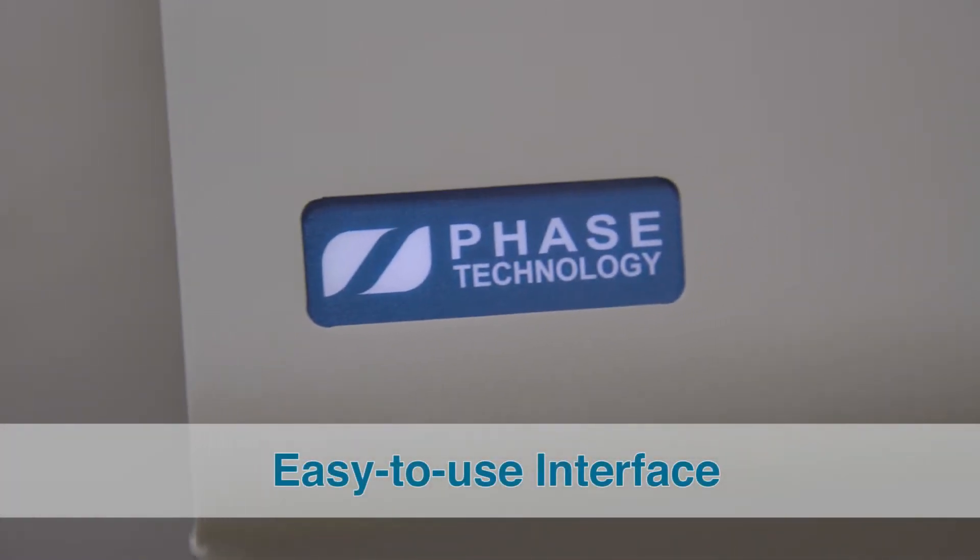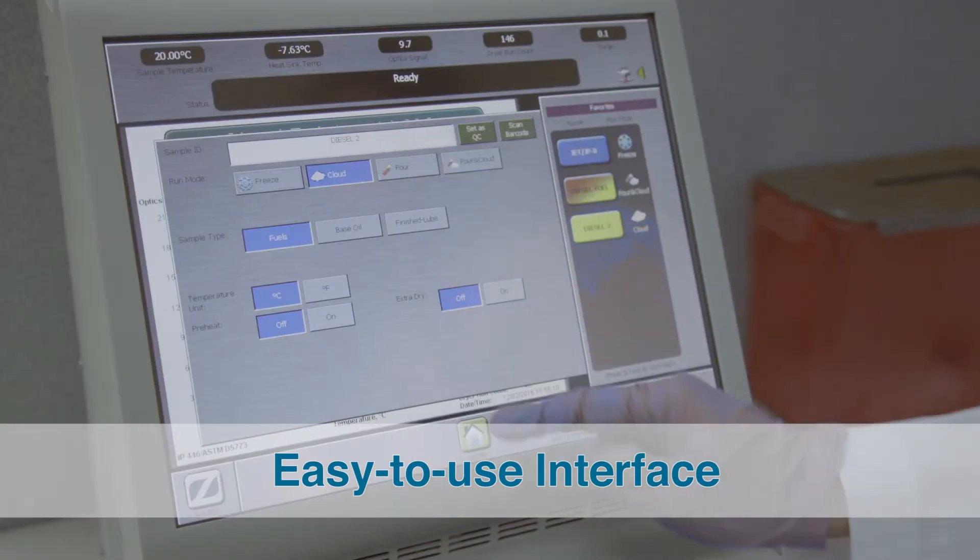Built on the 70XI platform, the JFA 70XI is intuitive and easy to understand.